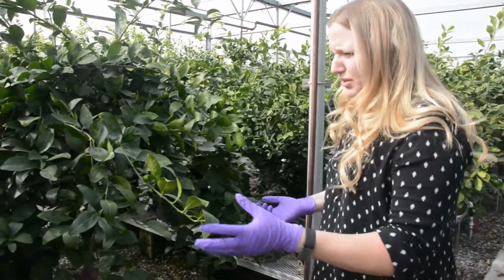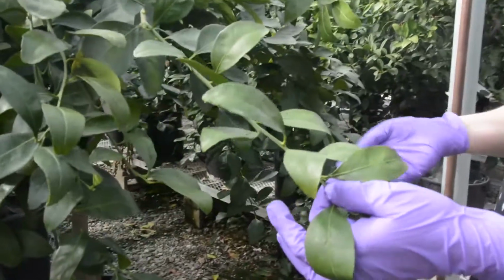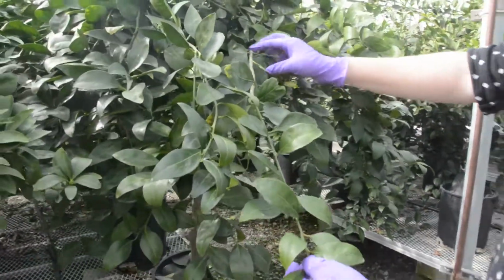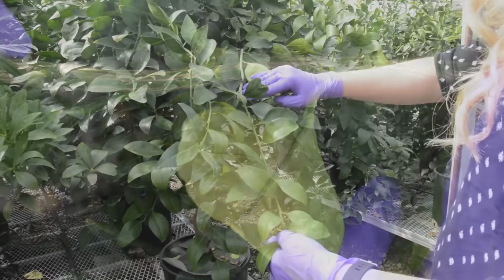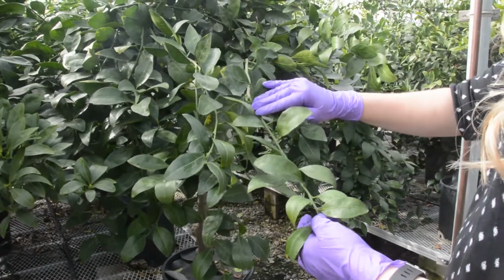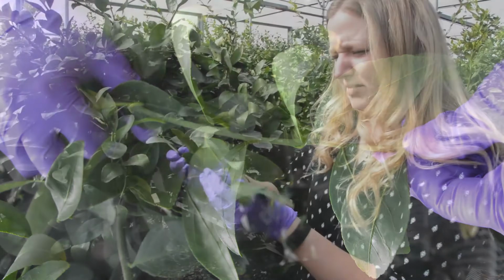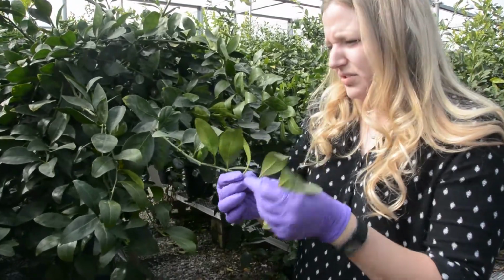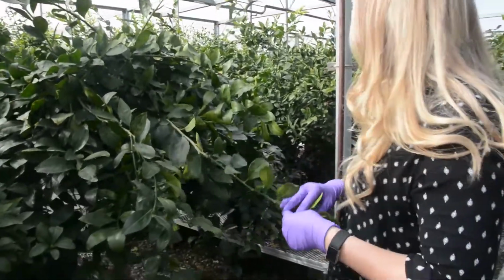What we do is we want to select the material that is the newest flush material. You can see this branch right here is older and a little bit woody in parts, but you just want to get the nice green piece right here. You do want the leaves to be fully expanded, and you do want the stem to be soft, but not too soft. At the end, it might get a little bit too soft, so we'll probably just cut that off. But that's pretty much the material that you want for cryopreservation.